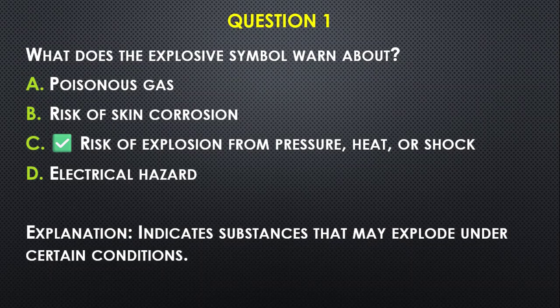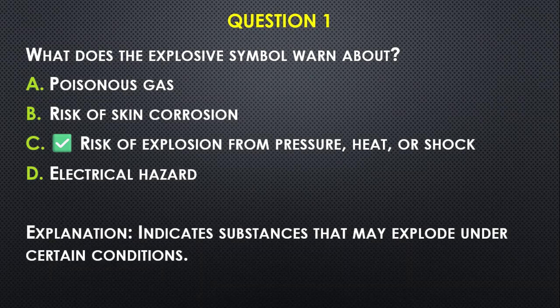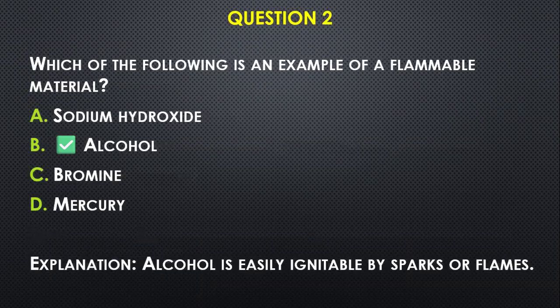Question number one: What does the explosive symbol warn about? A) poisonous gas, B) risk of skin corrosion, C) risk of explosion from pressure, heat, or shock, D) electrical hazard. Our answer is C, because it indicates substances that may explode under certain conditions.